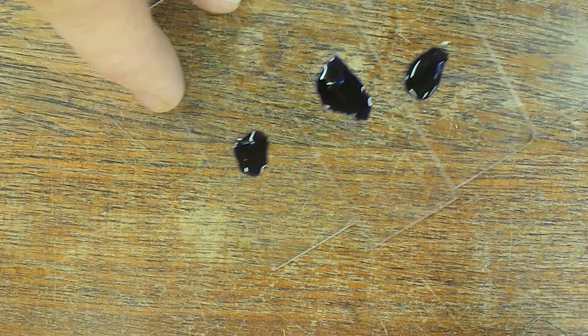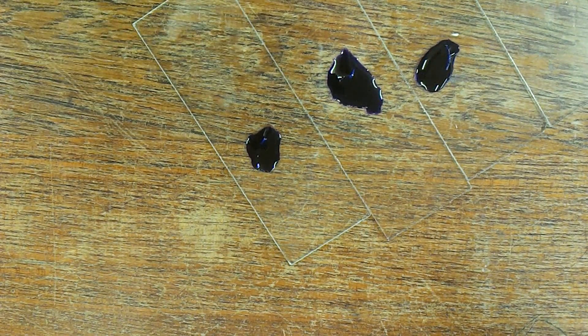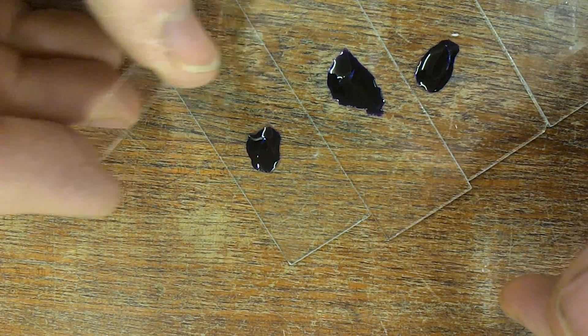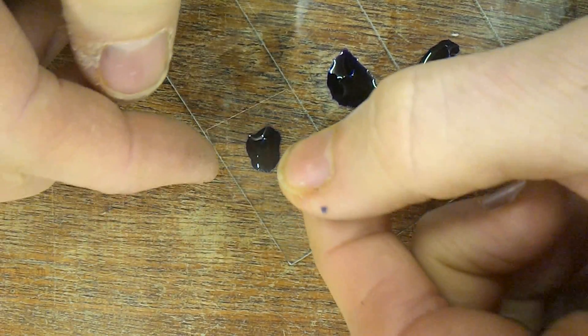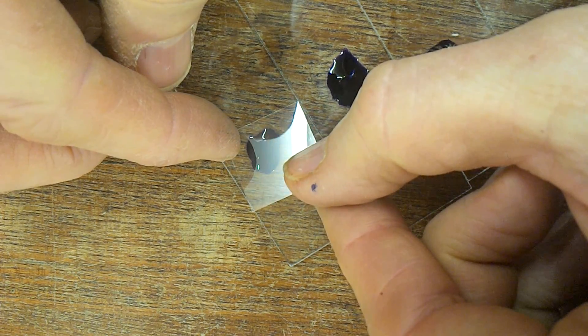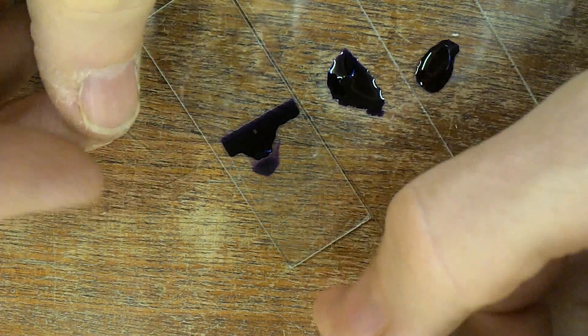To cover slip, bring your cover slip in at an angle at 45 degrees and lower it gently onto the stain. Then we're going to compress this to spread the cells.